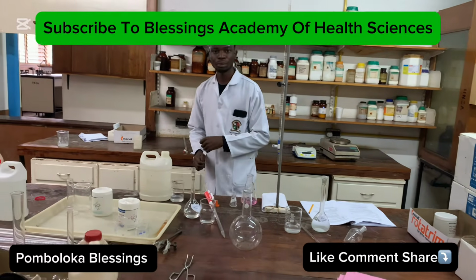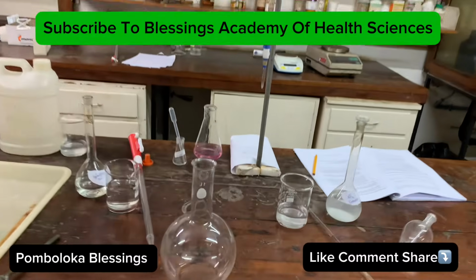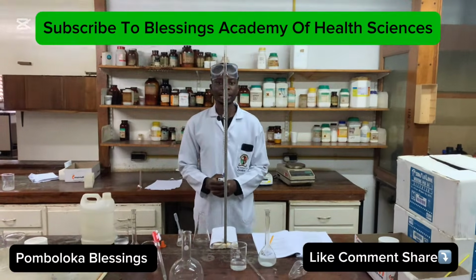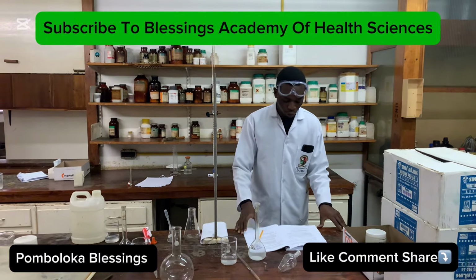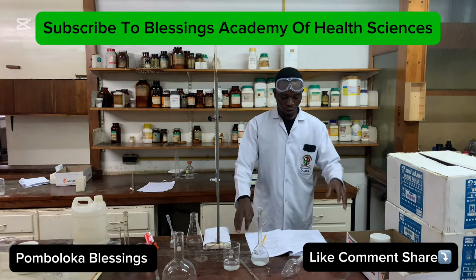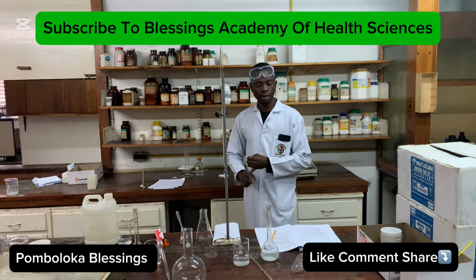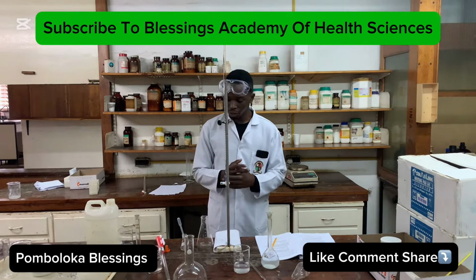All right, let's move on to the second part. So yeah, we've already done the first part of the experiment where we've done trial 1. So when you get back to your lab bank, you're going to notice that I've got the first part, which is a trial, and then the accurate titration. We need to titrate the first part, the second part, as well as the third part. So I did titrate for the first part. Let's now titrate for the second part.